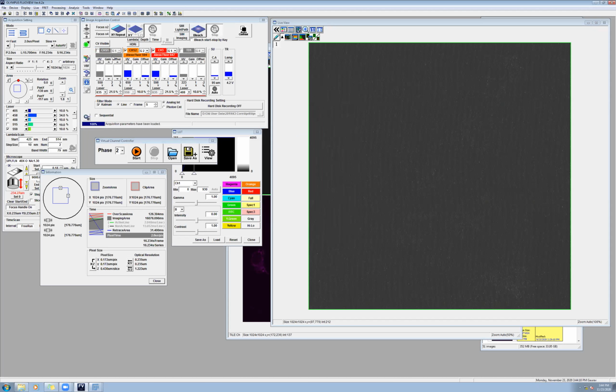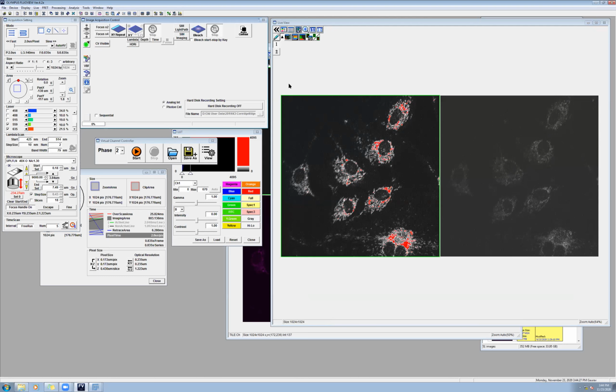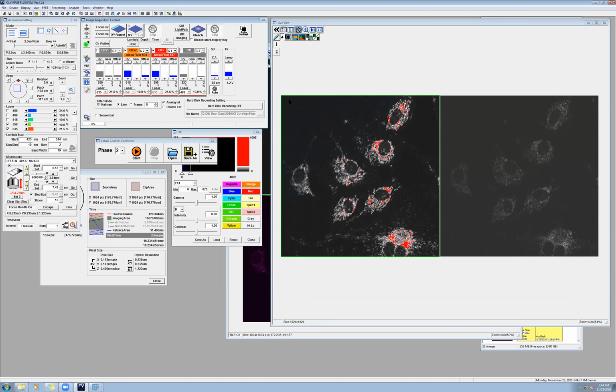And let's say I do this 600. So let's say if I do focus times 2, I get my mitochondria. And what you will see, interestingly, is the mitochondria is bleeding into 647, right?